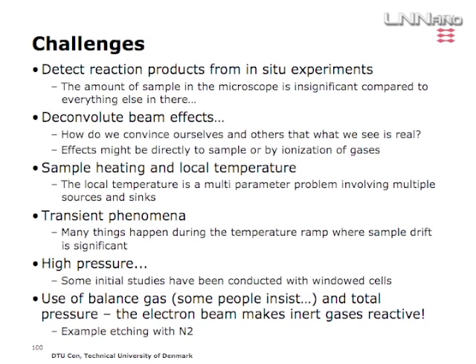Sample heating and local temperature: it's okay that we're measuring the temperature on an external device, but what is actually the real local temperature at the position of the beam? Transient phenomena are quite difficult to observe due to drift. That might to some extent be fixed by using these MEMS device holders. So if you're using this lab, you should definitely try that out.